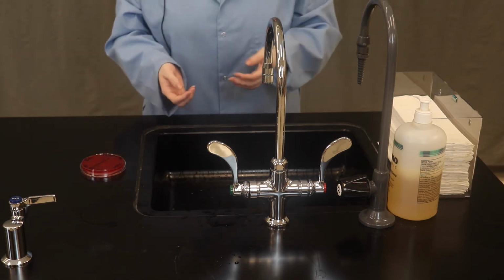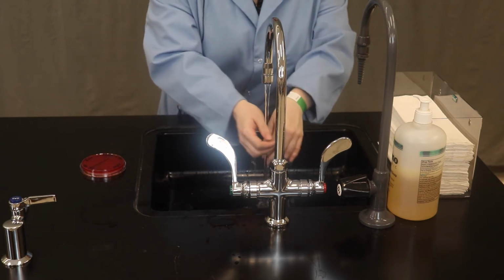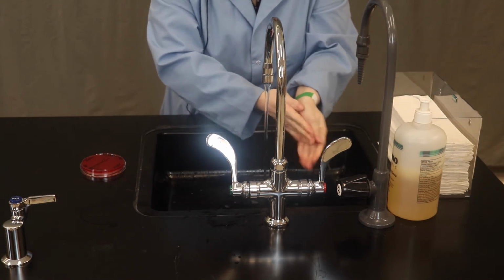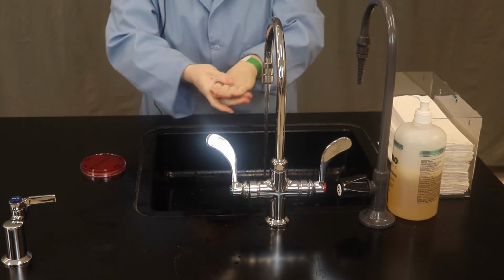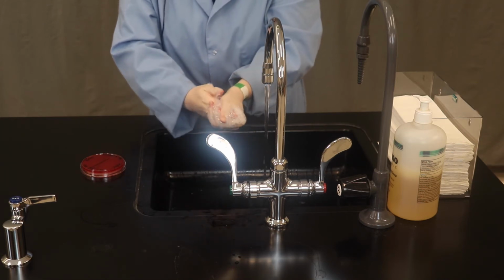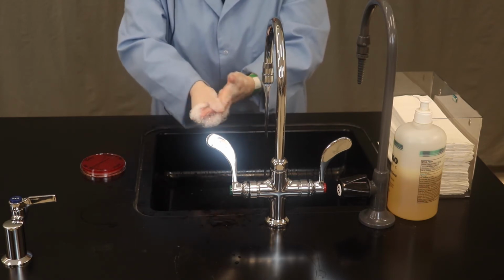To wash our hands, we're going to turn on our water source. I like to wet my hands first. Take a pump or two of your soap or your product. Start to scrub the soap in really well. You want suds. This is a mixture of mechanical friction, soaps, and surfactants that are going to help dislodge microbes from the surface of our skin through the action of mechanical friction.